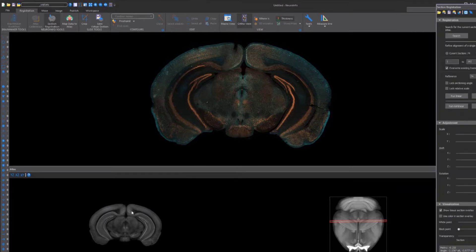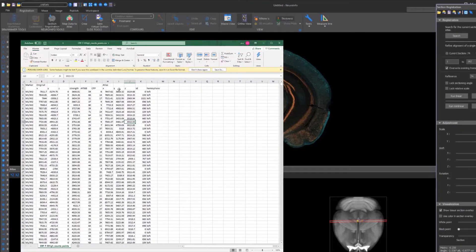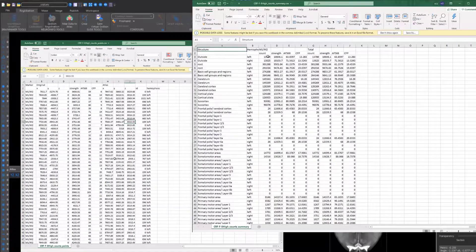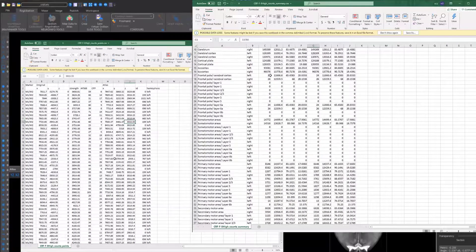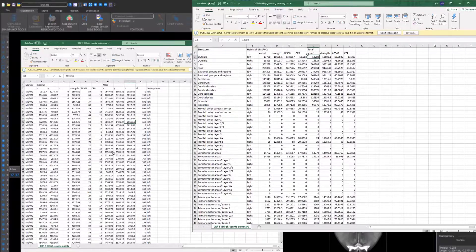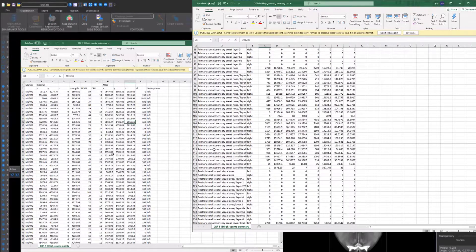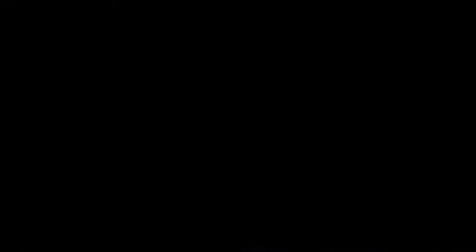Once the mapping is complete, you will then have your data in an Excel-compatible format where you can view a summary of cell counts by brain region, all your markers, the name of the markers, the cell coordinates in the original image space, and the cell coordinates in the atlas space.